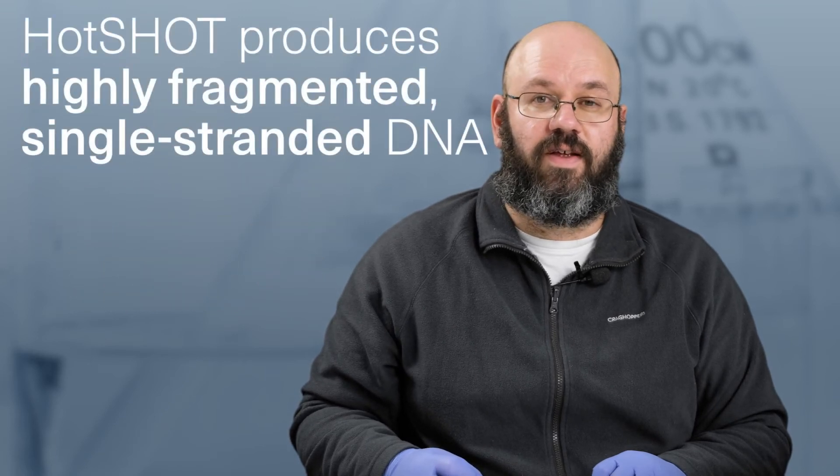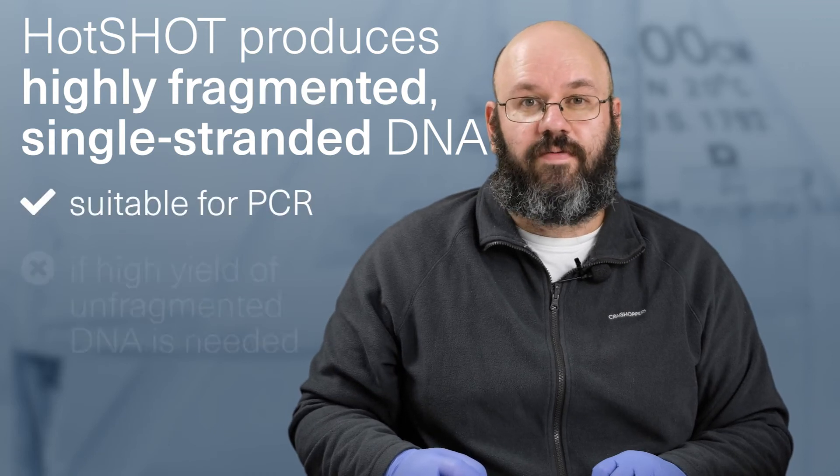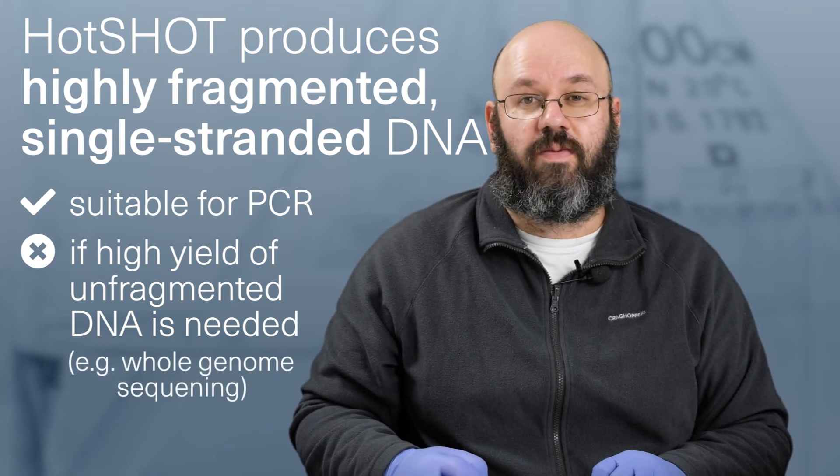You also need to know that the Hotshot method produces highly fragmented, single-stranded DNA. This is suitable for PCR, but not for applications where a high yield of unfragmented DNA is required, such as whole genome sequencing.